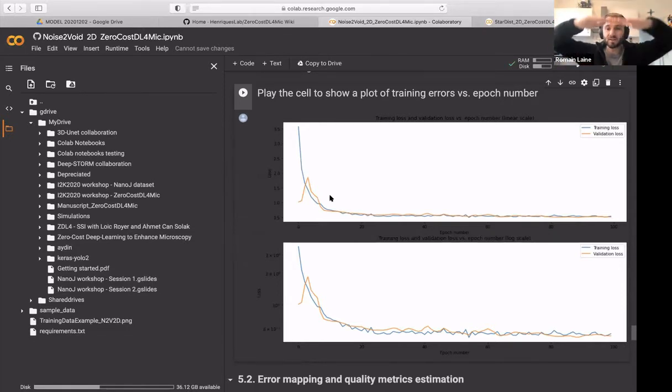So if it's shifted up or down with respect to the training loss, it really doesn't matter. It depends only on which patches are selected for validation and for training, which will be different for each one of our sessions, of course. What really matters is how it evolved over time and not the absolute value. So if it's shifted, you can just ignore it.